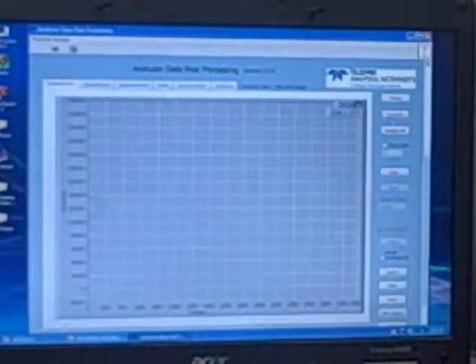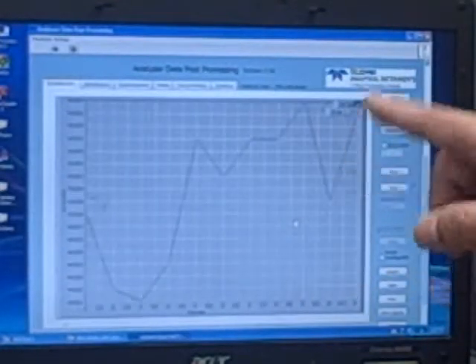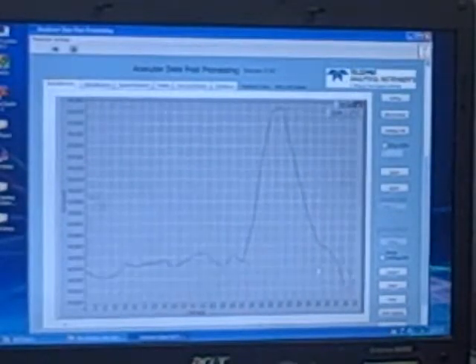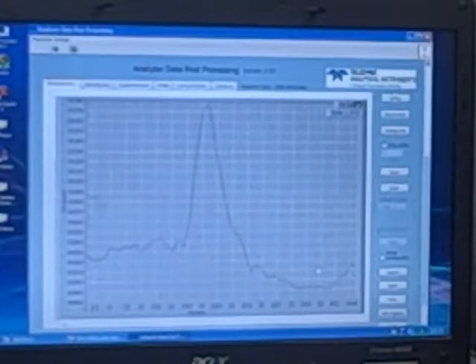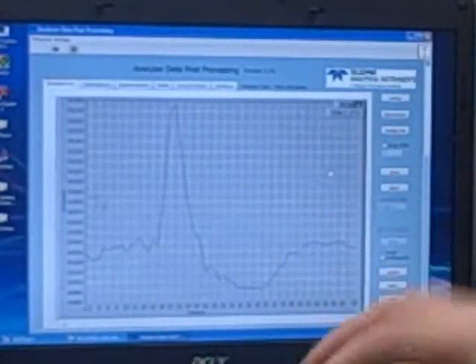Now you want to establish a communication. Then you click connect. By doing that, the machine is talking to the analyzer. You can see the curve is jumping around. Okay, this is because it's automatic scaling. If nothing happened, it means it failed. So no measurement. So now communication is established.